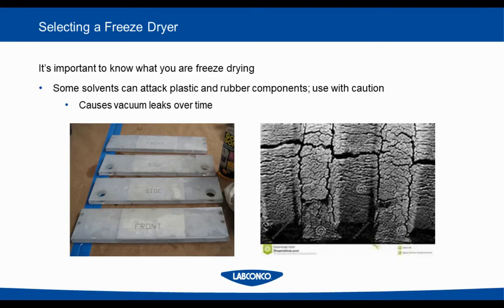It's critical that you choose the right materials when selecting a freeze dryer. Many solvents used in samples can attack plastic and rubber components, which cause vacuums to leak over time. The use of acids can also damage materials like stainless steel and acrylic.